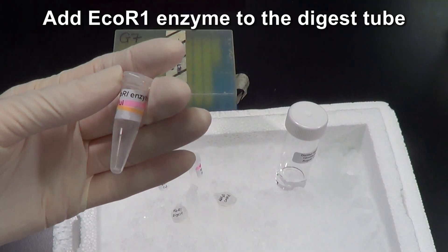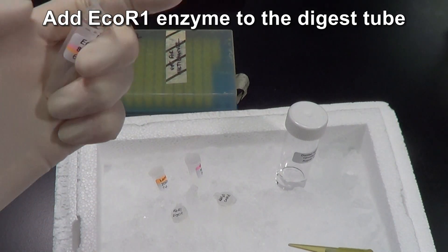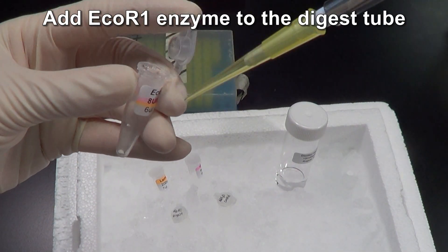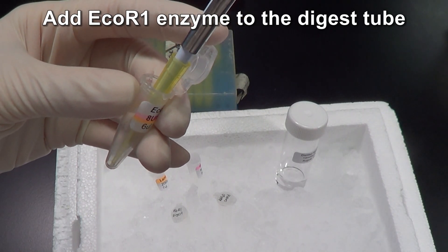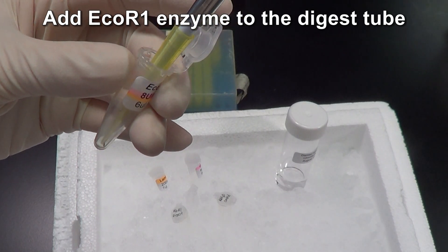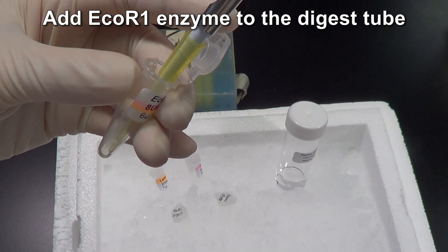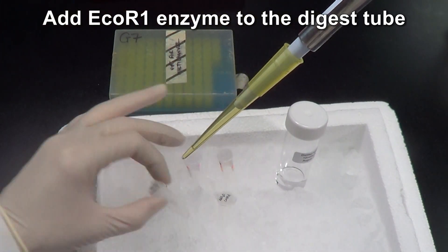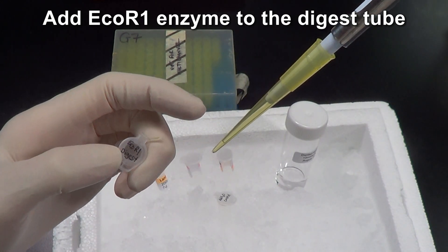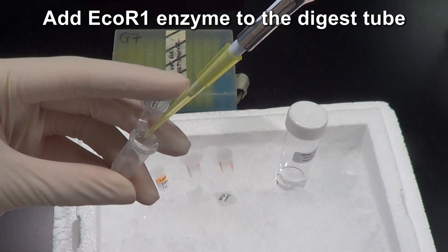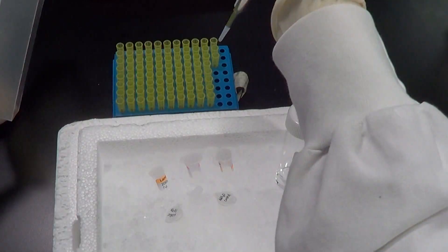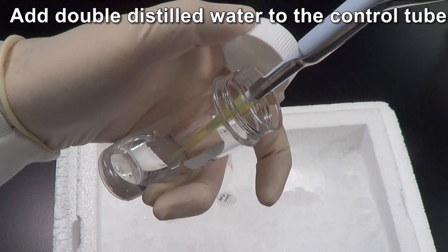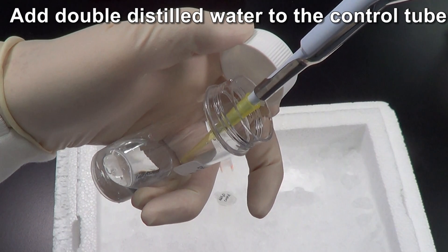Add EcoR1 enzyme to the digest. Add an equal volume of distilled water to the control tube.